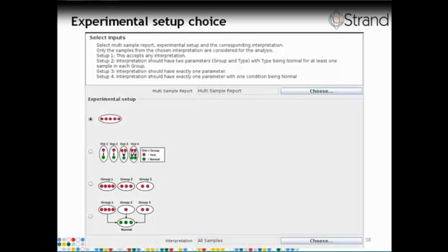So the chart gives visual clues on what would happen if these filtering criteria were to change, and the user is free to modify these different criteria. For instance, if we want to set a more stringent value for the percentage of supporting reads, we could change it to 85, and now we see that there are only 44 alleles which have such a high confidence in more than 50% of the samples.